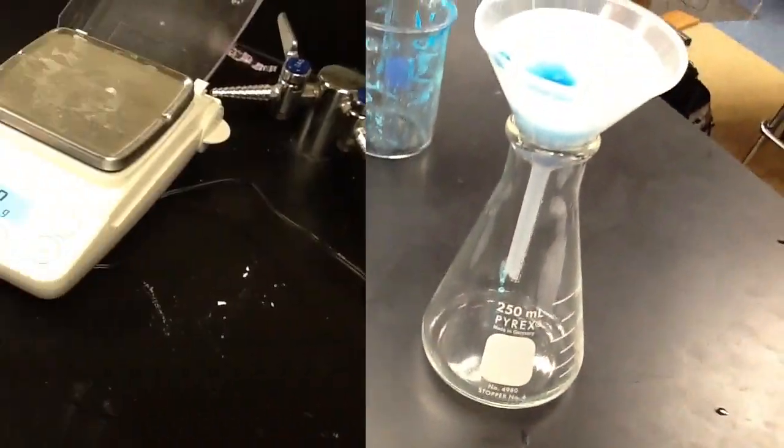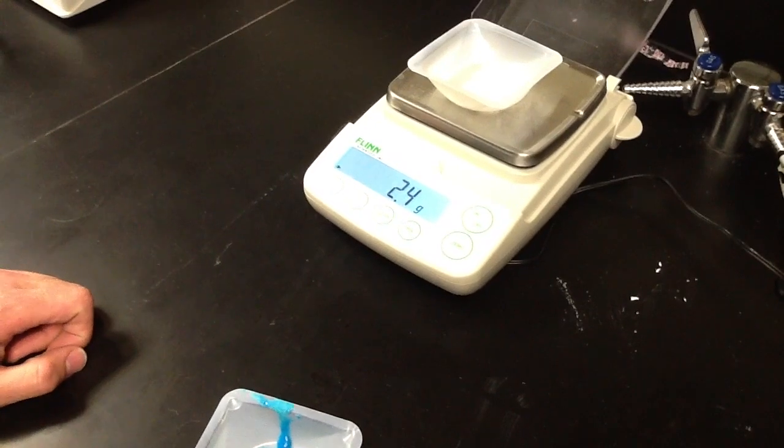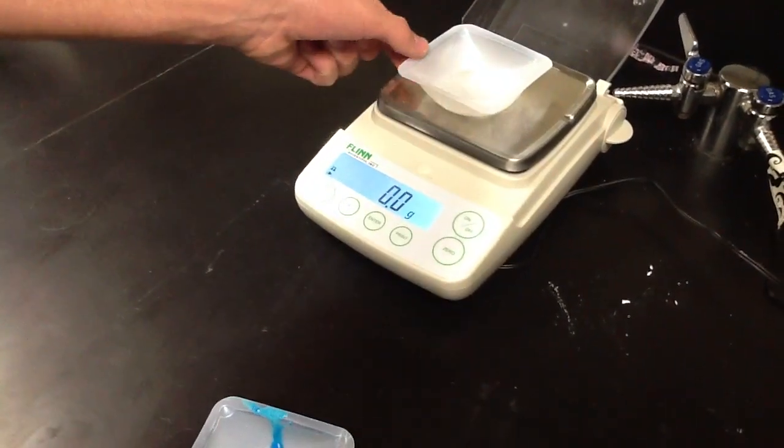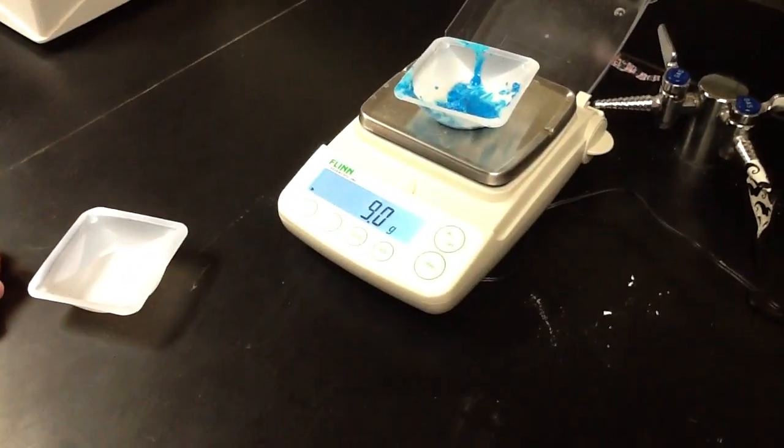The copper hydroxide should look like this. The next step is to zero out the weigh boat and then place the weigh boat with the product on the scale to get the weight of the product.